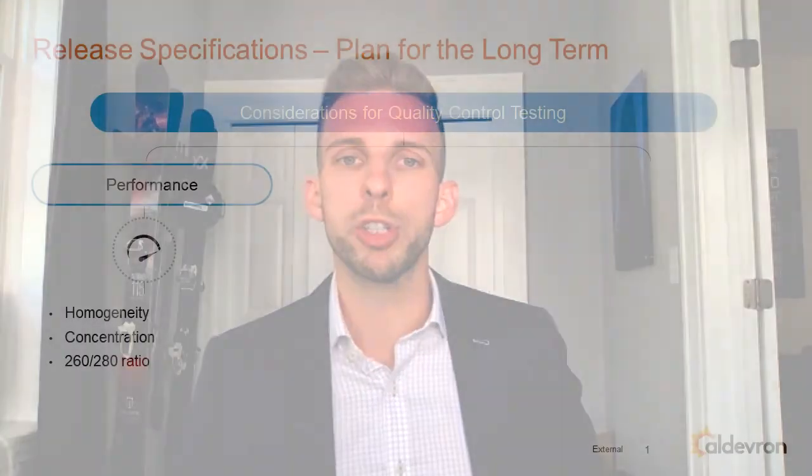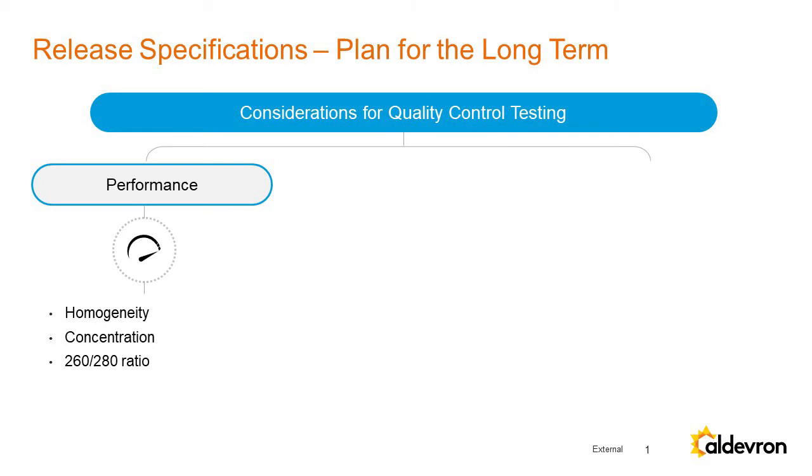But ultimately, all of our clients are shifting to full GMP manufacturing as they progress through late phase and really seriously gearing up for commercial. I'll move next to some considerations around release specifications and quality control. The heightened focus on CMC also extends into release testing and specifications.